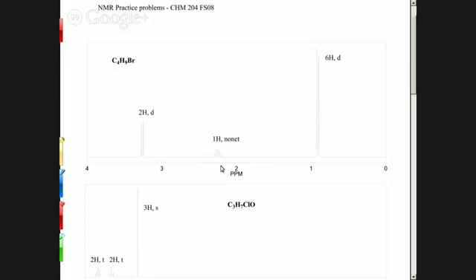Right, so you have two CH3s that are connected to a C in the middle. These two are indistinguishable, so that makes a group of 6. But then there's one hydrogen. Right, so now you got a CH group also. So now you got pieces: a CH2, a CH, two CH3s, and then a bromine.